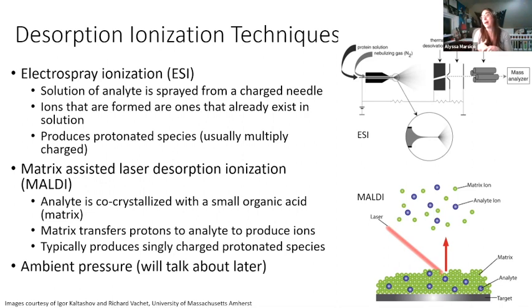Electrospray is also very commonly used for protein analysis. So those of you who may be interested in going to grad school and using mass spec, one of the more common fields that you'll use mass spec in outside of forensic science is proteomics.